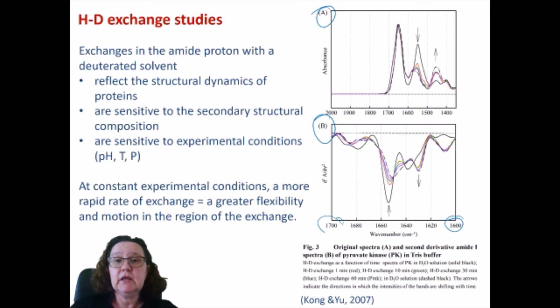So again, you can study both experimental conditions and the behavior of that amide proton, and the structural behavior of the protein in the presence of water, solvents, pH changes, or other chemicals. For example, a substrate, if you are looking at an enzyme behavioral activity study.